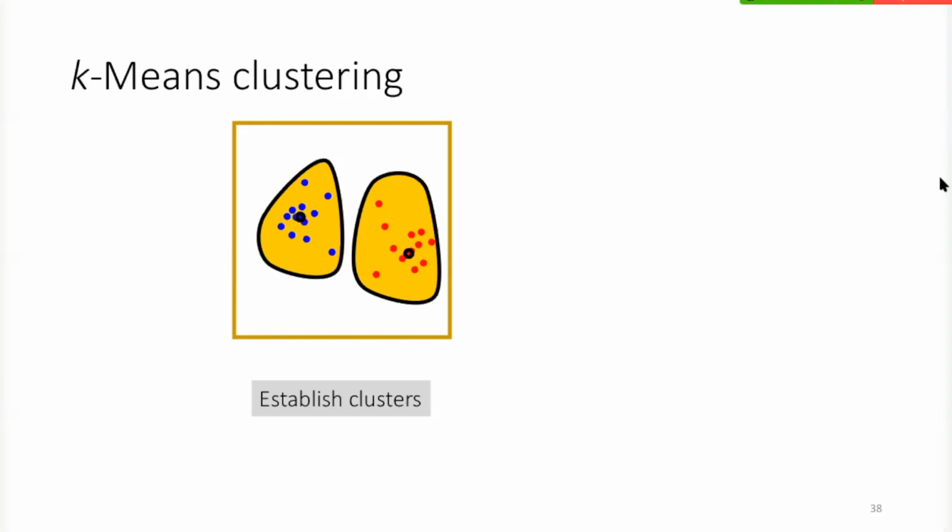We'll see. It's a bit easier to stay away from it in graph-based clustering because it's a bit farther away. While in k-means and hierarchical clustering, you set it: you say, I want this many clusters. It might be named something else, like a distance or a similarity between your objects, but at the end it's a selection on the number of clusters.